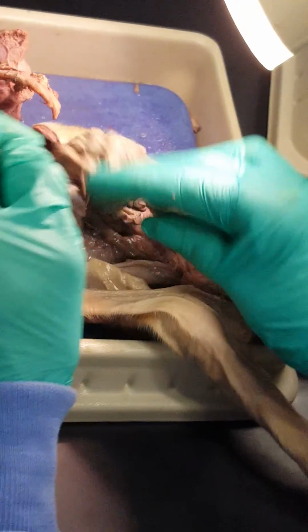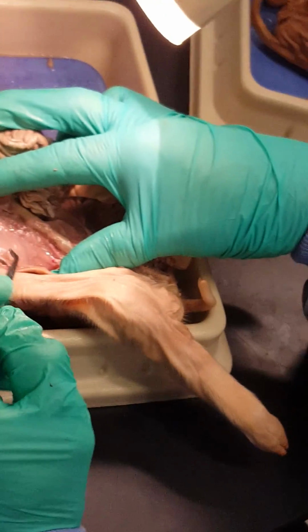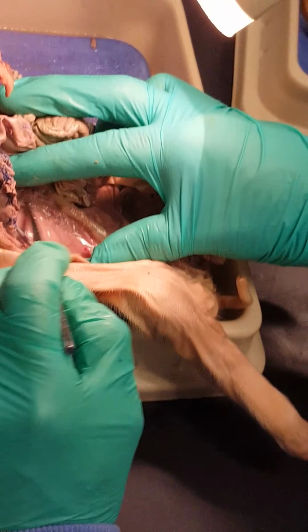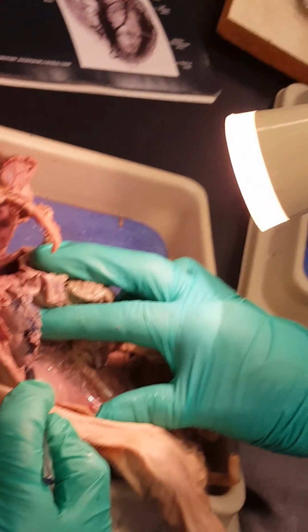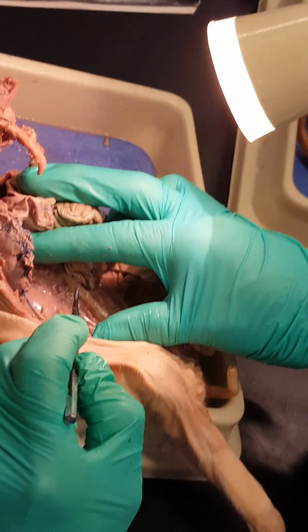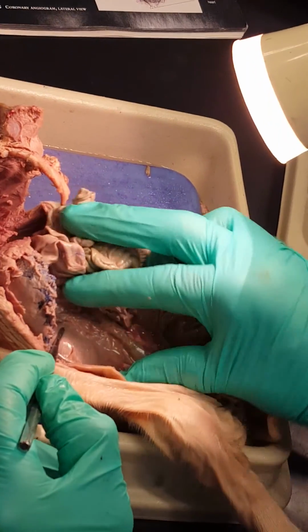On the other side, I left the kidneys in their more natural position, which we described as retroperitoneal, right? So they and the aorta are behind the peritoneum. So is the aorta always behind the peritoneum? It's retroperitoneal too. Okay. You can kind of see what that looks like.